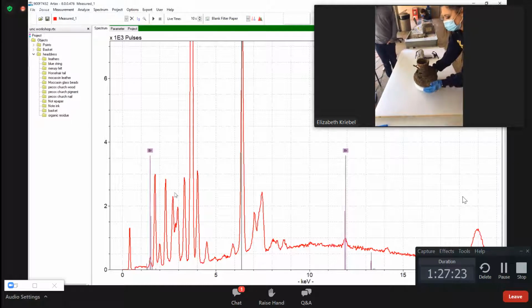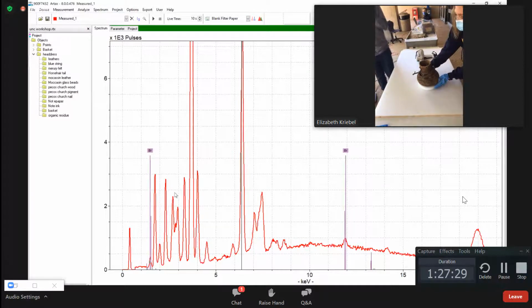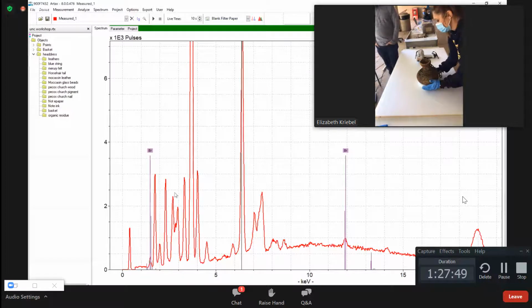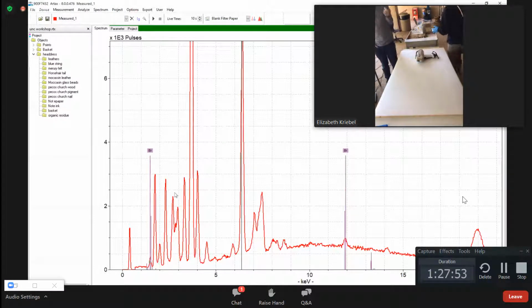Safe-ish. I don't think I'd drink the stuff, but do you want to test any of this? You can, if you want to. My worry with this is, do you see how it's poking up? The chance that this ruptures our 4 micron polypropylene window is extremely high. We'd have to find a nice angle to do it, but it's too spiky, I think. So we'll do that last. We'll break your instrument. I do have extra windows.